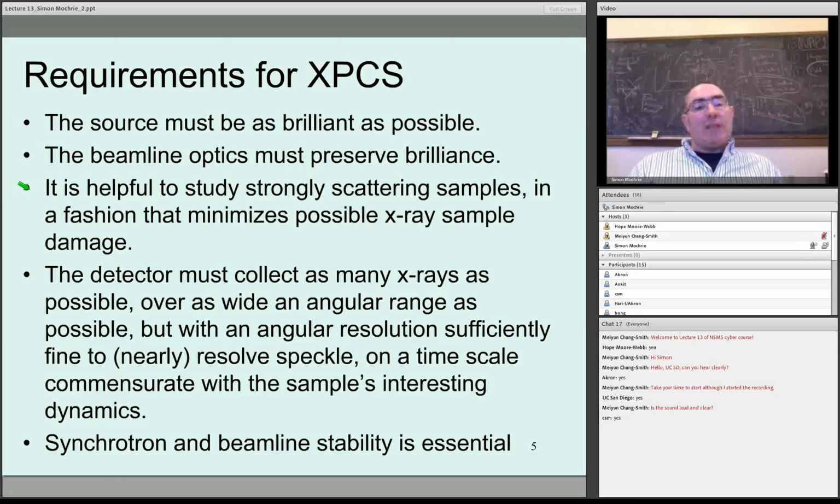The second example that I'll talk about, namely the polymer system, is actually relatively strongly scattering for an X-ray experiment, but significantly more weakly scattering than the colloidal suspension. And consequently, you have to collect data for longer. The signal to noise may not be as good. It isn't as good.